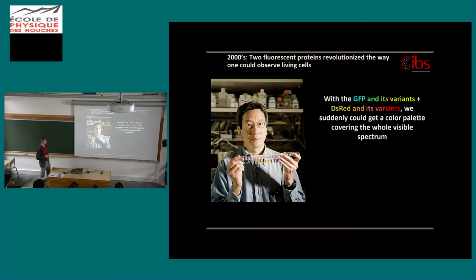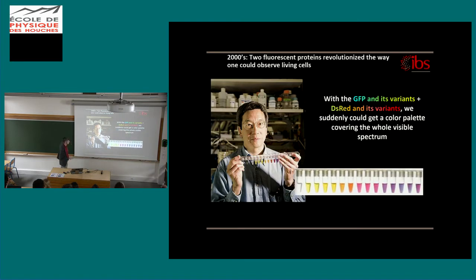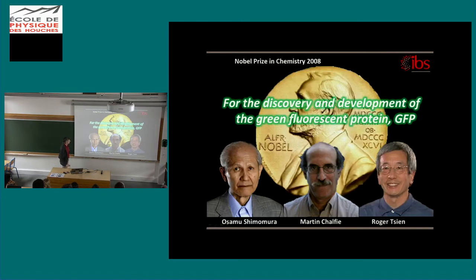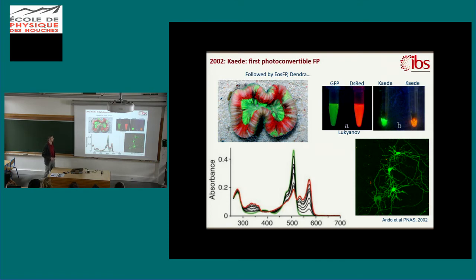And in the 2000s, we ended with two fluorescent proteins that revolutionized the way we could observe living cells, because Roger Tsien covered the whole palette of the GFP from blue to yellow, and DsRed from yellow to red. So we had everything, which is here between his hands, and that Dominic showed during his first presentation. That's what it looks like in ambient light and in fluorescence. So here you have everything, all the names that you know. And it was, of course, awarded the Nobel Prize in Chemistry in 2008.